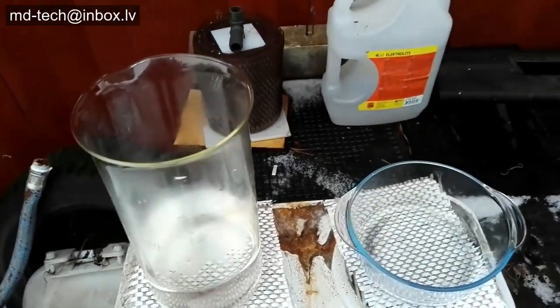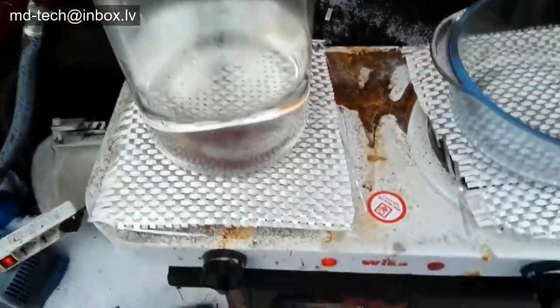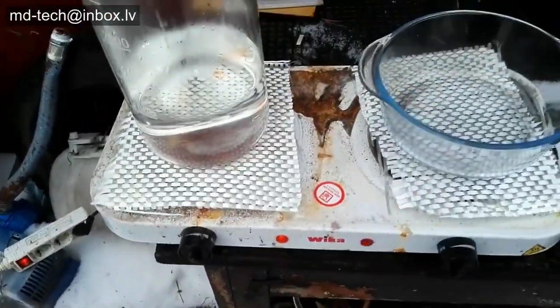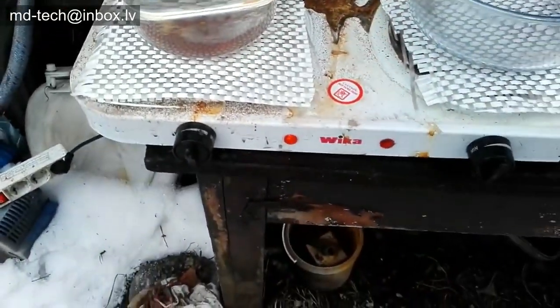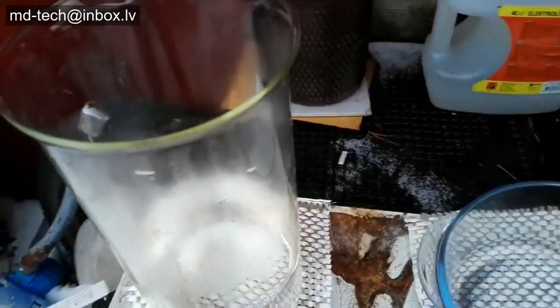I have this old video. I made ferrous sulfate, also called copperous. Ferrous sulfate is perfect for gold precipitation from aqua regia.